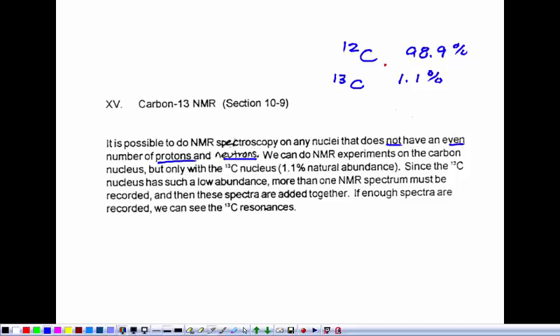It might take us 5 minutes, it might take us 5 hours. It might take us 15 hours, depending on the concentration. Then we can look at each carbon in the molecule. And that's the limitation. When I was an undergraduate, we couldn't do carbon because we had an instrument that did 1 scan. So you weren't seeing carbon-13. Okay?